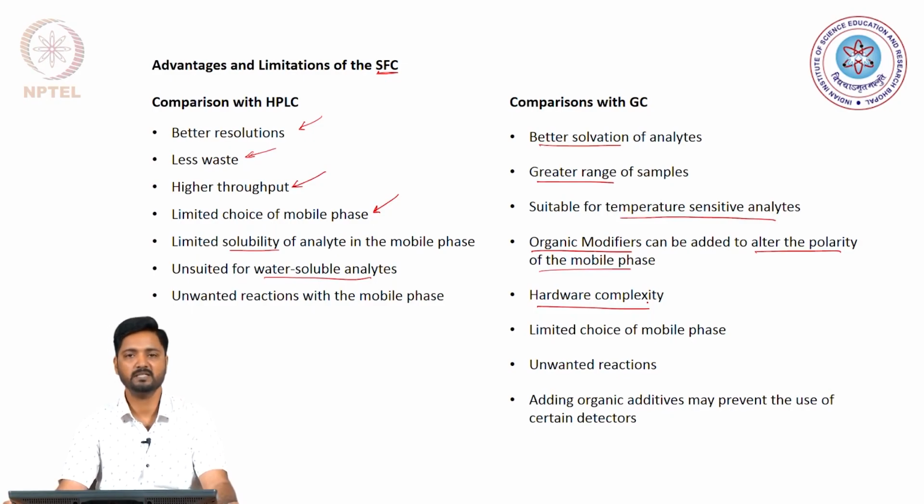Now, we have realized that all the properties of supercritical fluids are very sensitive to changes in temperatures and pressures. So, we need to maintain or alter them in a very precise manner, so that we are able to change the properties of our supercritical fluids appropriately. This brings about hardware requirement to be more complex when compared to gas chromatography, and that adds to the cost of the supercritical fluid chromatography systems.